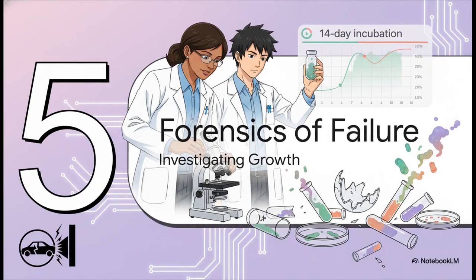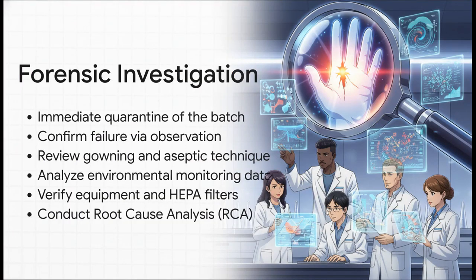Okay, Section 5, Forensics of a Failure, Investigating Microbial Growth. So what actually happens when the crash test fails, and we spot that dreaded cloudiness in a vial? We immediately pivot into a systematic, full-blown forensic investigation. Step 1, immediate quarantine of the batch. Production halts entirely. Then we backtrack. We comb through operator gowning logs. We scrutinize all that environmental monitoring data we just talked about, and we rigorously verify the HVAC airflow and equipment calibration. We'll bring in root cause analysis tools, like the 5 whys or fishbone diagrams, to pinpoint the exact source of the breach. Was it just a microscopic tear in a glove? A sudden drop in air pressure? We literally cannot move forward until we find out.